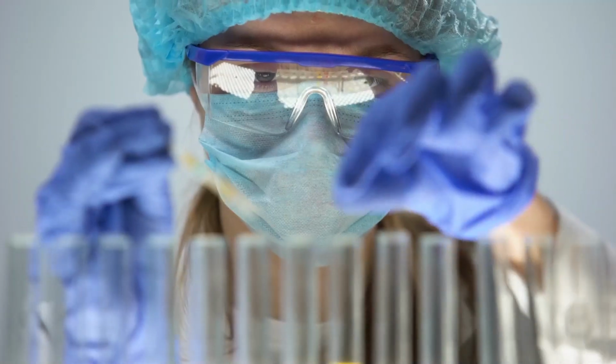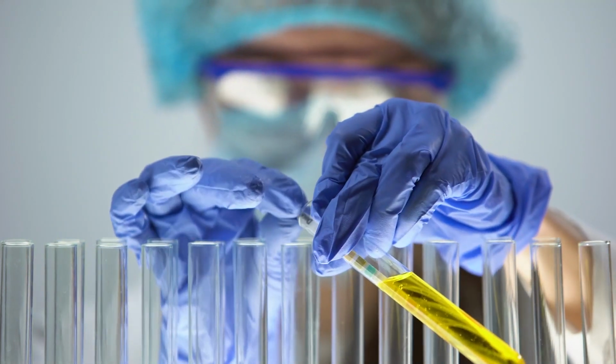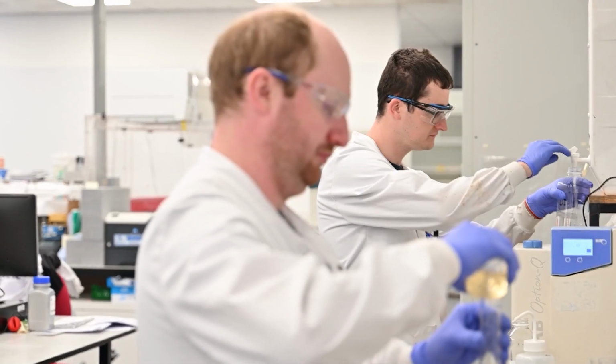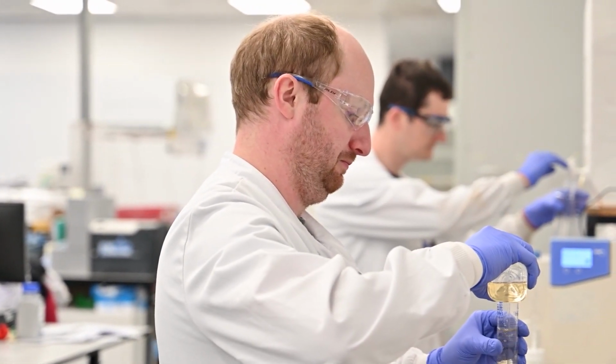We'll probably then try to see if the sample's soluble in water. If it's soluble in water, or we just do a water extract, we'll probably take a pH, so we'll be looking to see if there are any acids or alkalis present. If there are, it might go down our ion chromatography system, looking for the anions and cations associated with acids and alkalis and things like that.